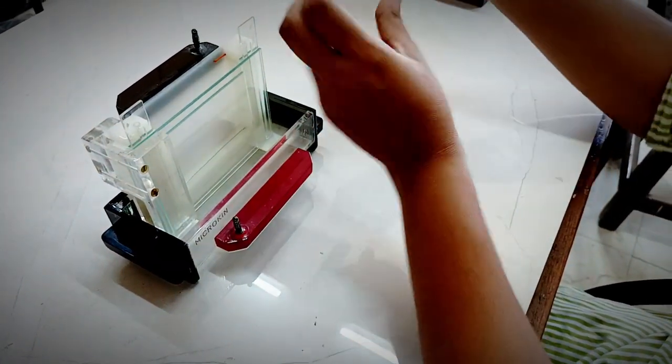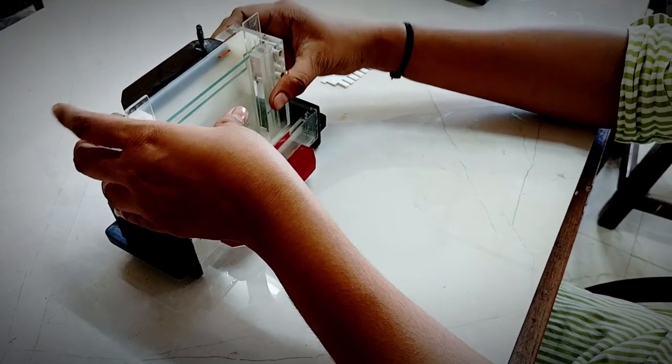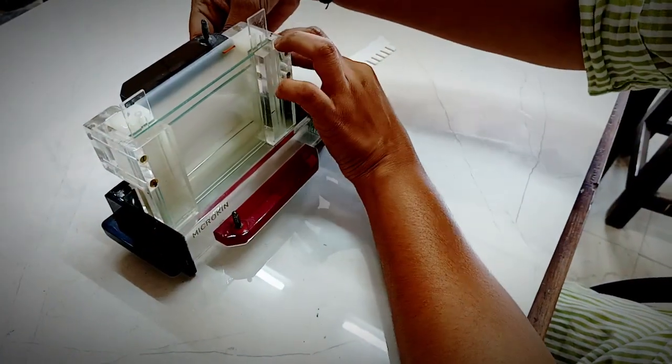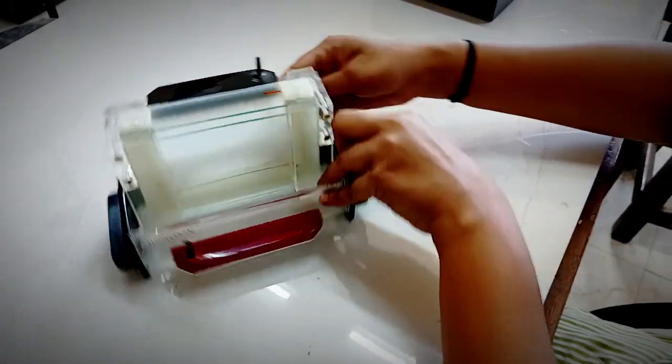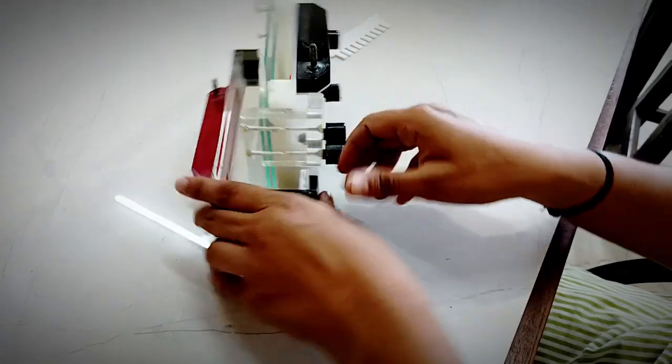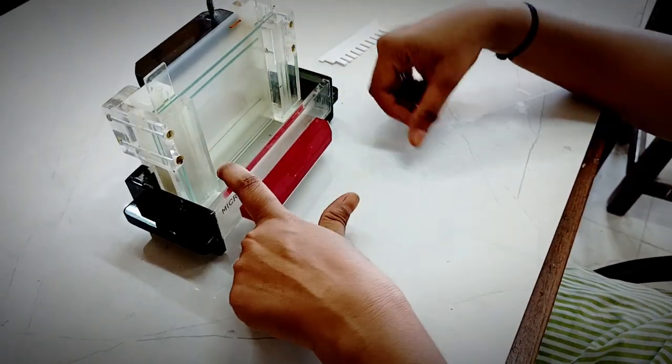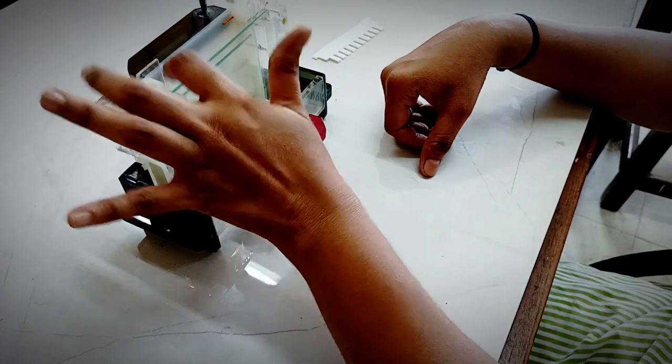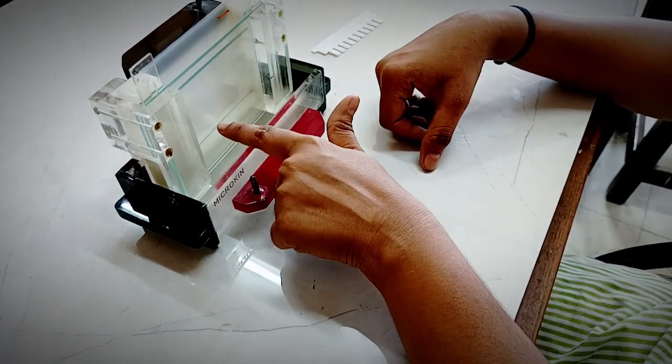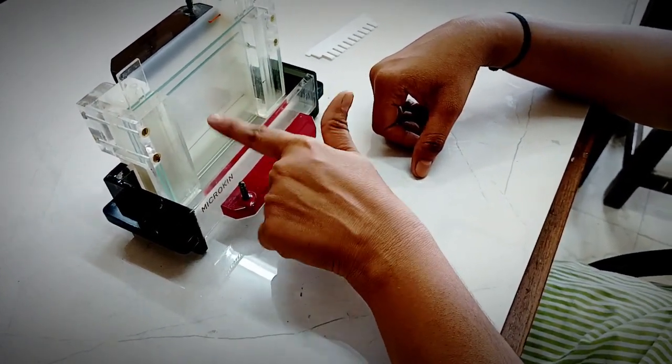Now similarly, on the other side also, you are going to place this and fix it. You have to make the screws tight. Now here you will add tank buffer, here also you will add tank buffer, and in between the glass plates, you will add the polyacrylamide gel.